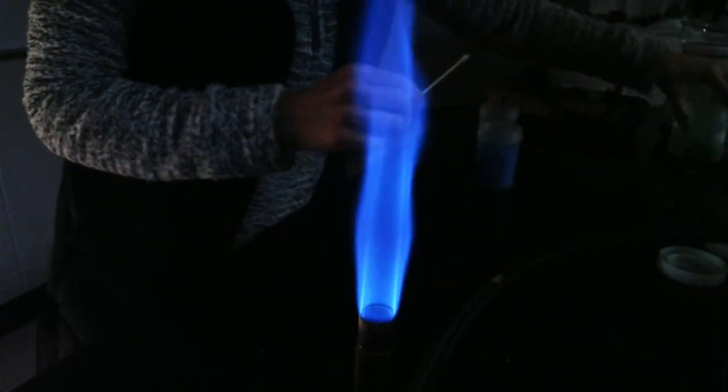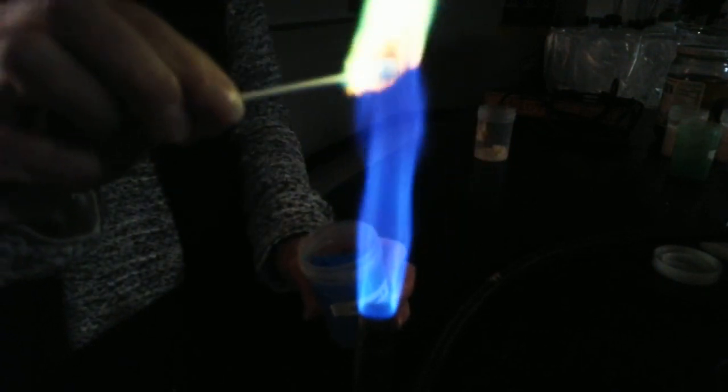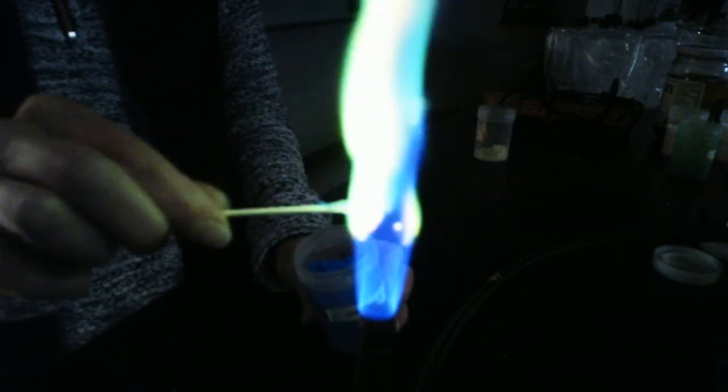And you can see that in this. Okay, so here was the copper chloride, which was kind of a green color. Well, this is mystery unknown A. It's blue. I don't know if you can kind of see it. It's a blue solid. I didn't test any blue solids yet. I don't know if you can kind of see this one.